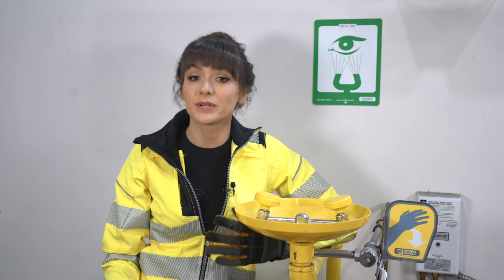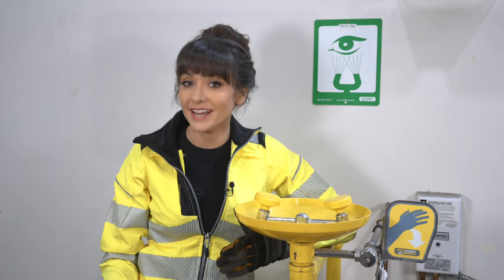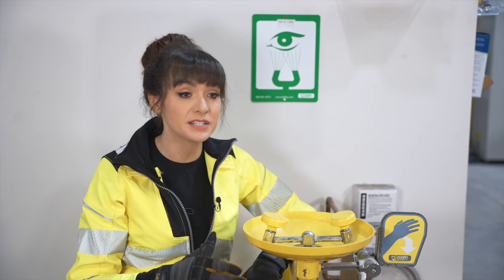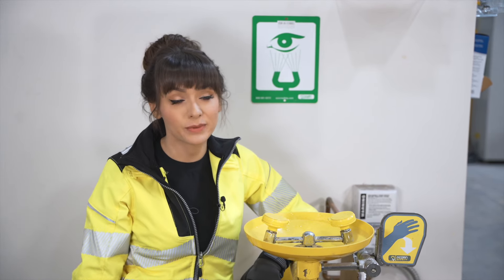There aren't a lot of emergencies that trigger the same amount of internal panic as getting something painful in your eye. It's when you're blinded and in a hurry to find relief that eyewash stations need to be available and ready to use.